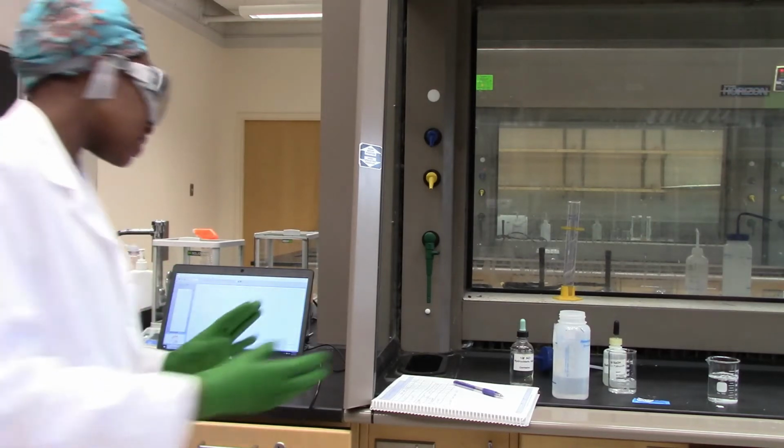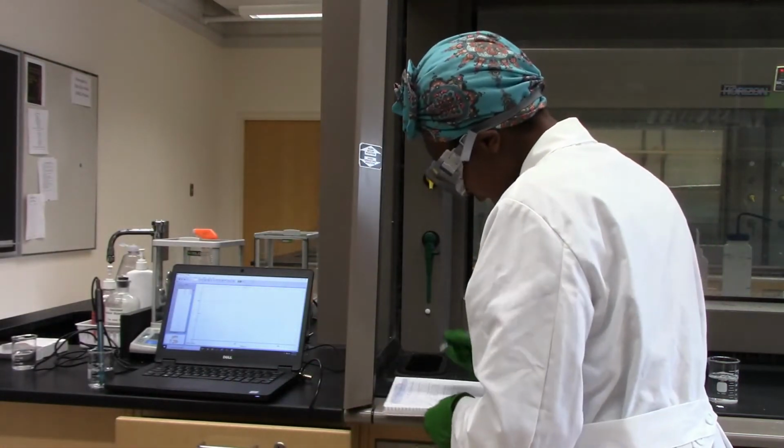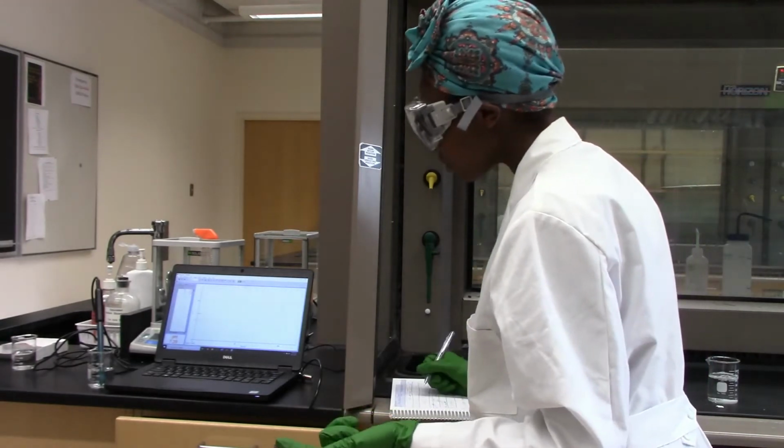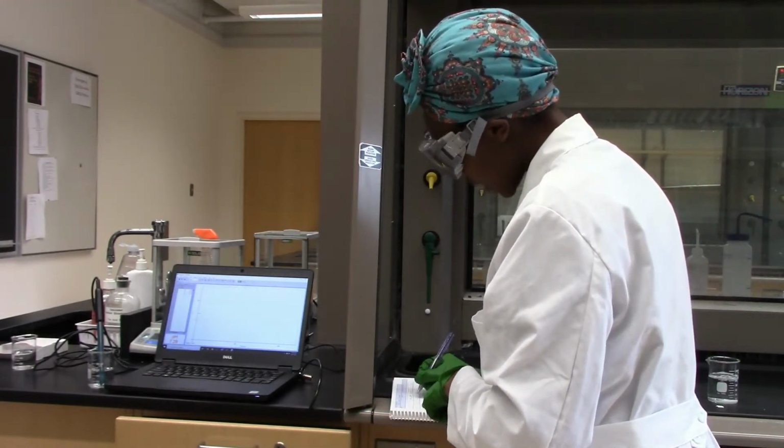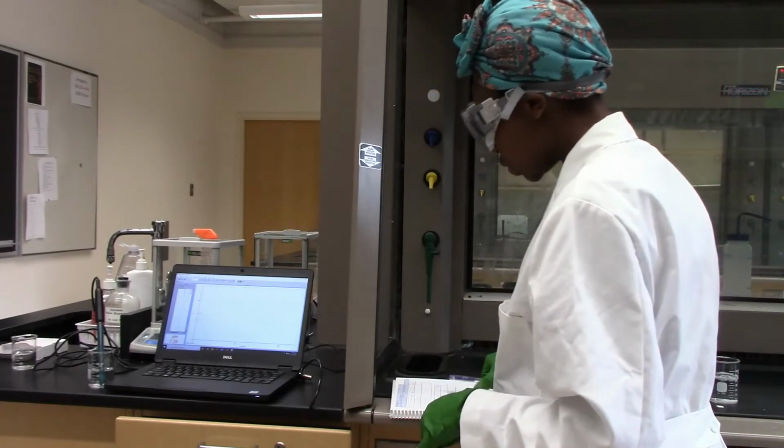Okay, this one says it's 7.28, so I know that it's within that range, and I'm just going to record this pH reading as my reference pH for water, and it's 7.29.